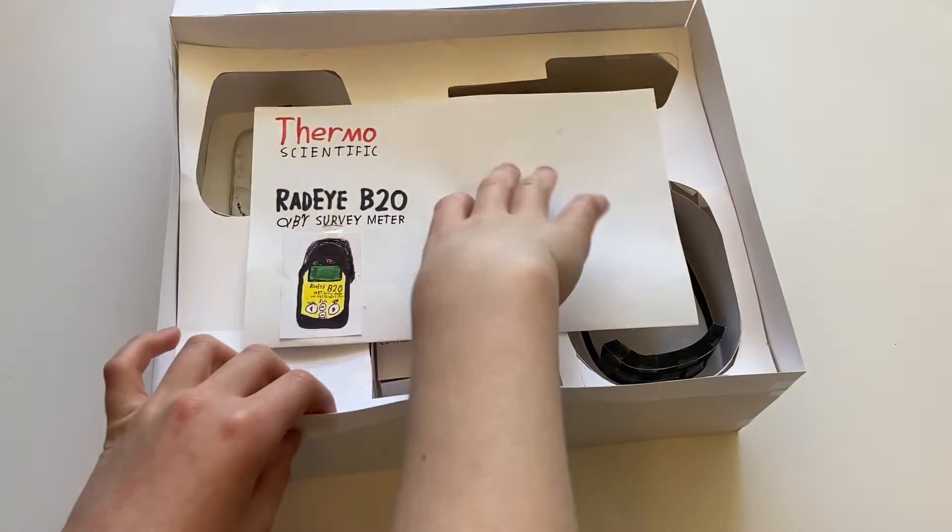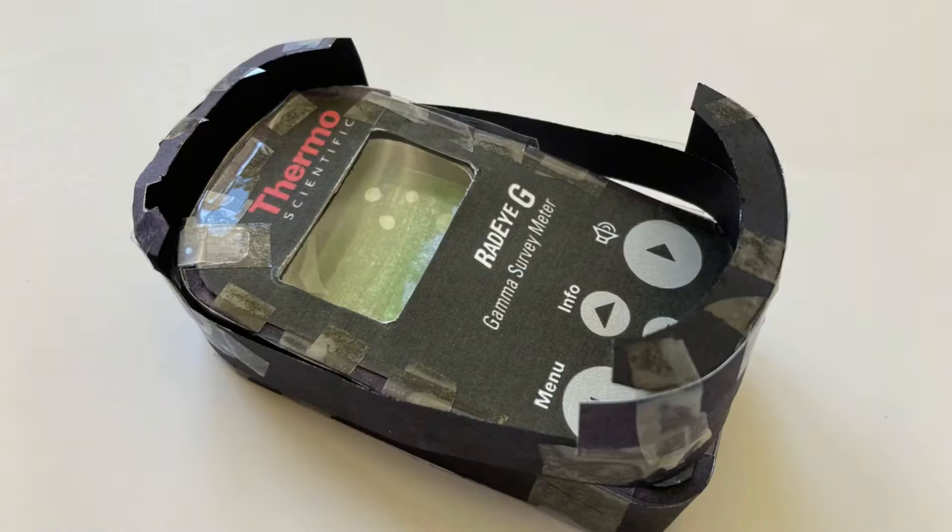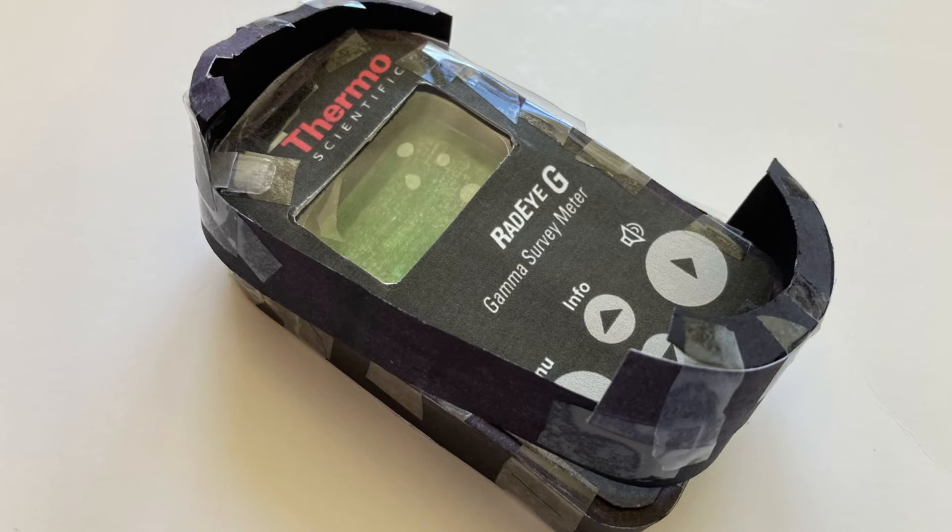First, if your meter is in a Cardi case, you'll want to remove it. Next, follow this procedure to install the rubber shock protector.